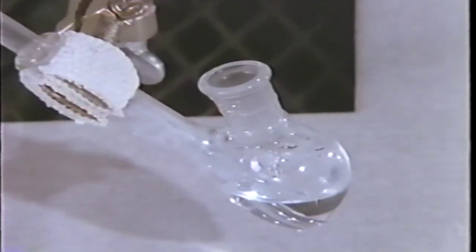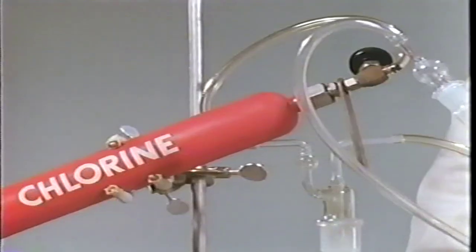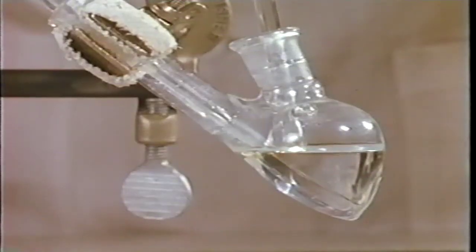Because of its high solubility, the hydrogen bromide which was formed should have collected in the water in this receiving flask. To check this, we again bubble chlorine through the solution. The characteristic color of aqueous bromine appears. The bromide ions in the hydrogen bromide solution are oxidized by chlorine to produce elemental bromine. Thus, we have succeeded in concentrating the bromine from the seawater into a much smaller volume of solution.